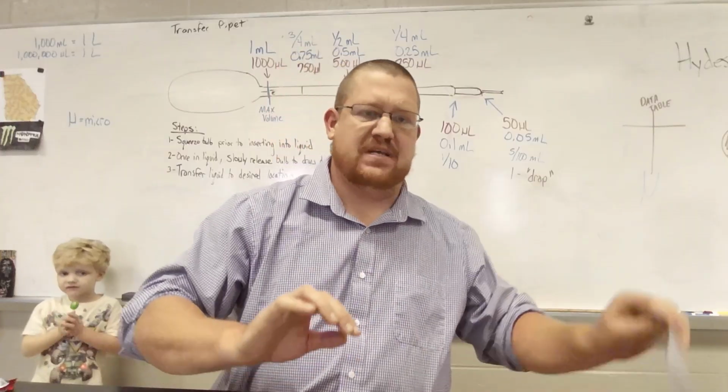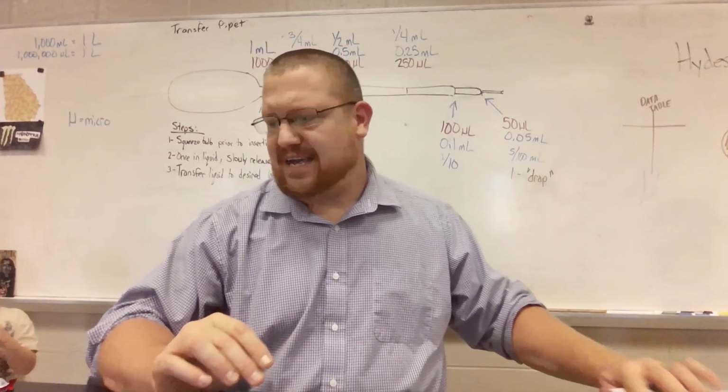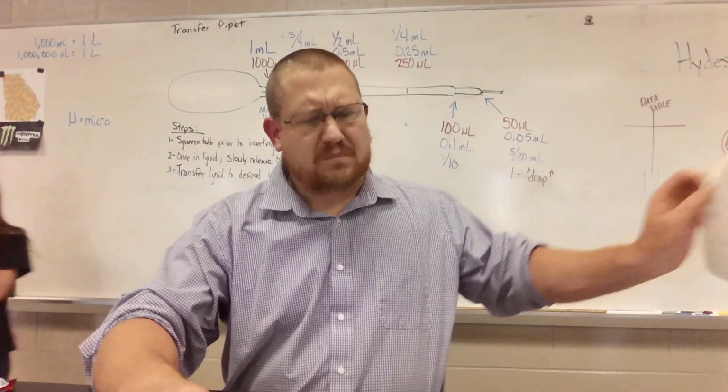So we start off with the class notes. These are available on the website for you to review on hydescience.net and EBT Unit 1. And then we dive into our lab protocol.